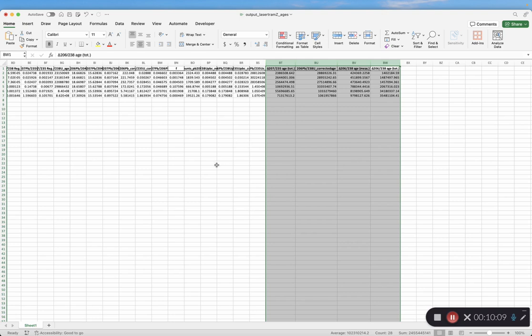If you have any questions at all, please email me. This program is very much under construction. The calculations are right, but there are some bugs, right? You saw the small graph, the little NaN thing. This program has not been the focus of my coding efforts as of late.